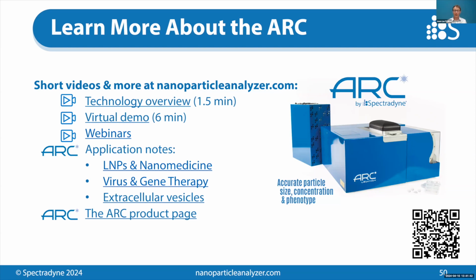All right. Next question. Could you summarize in a nutshell the greatest advantage of ARC with respect to NTA? Okay, I love this question. Thank you for asking it. NTA is really not very quantitative. I know people like to use it that way, but first of all, in terms of size, the limit of detection of NTA is dependent on the sample that you're trying to measure, right?